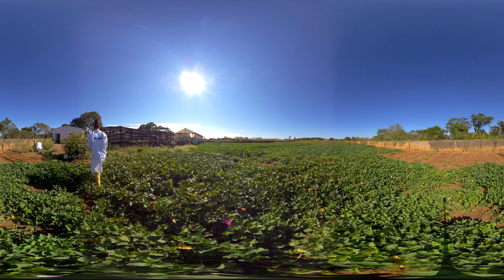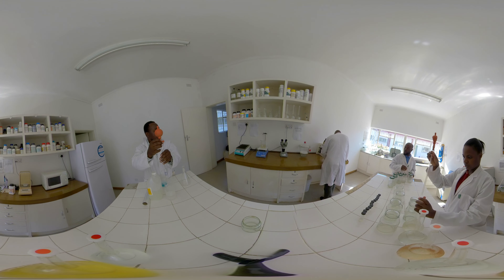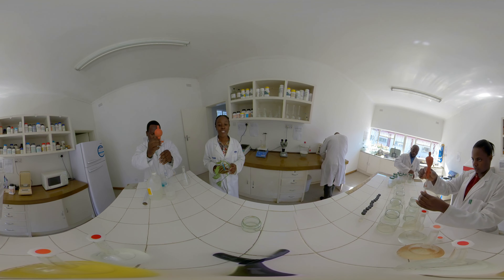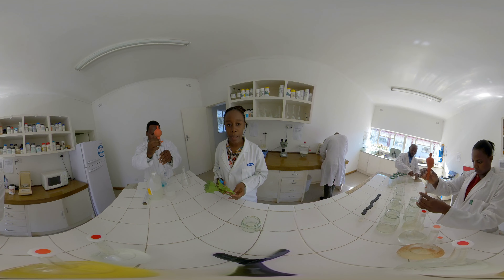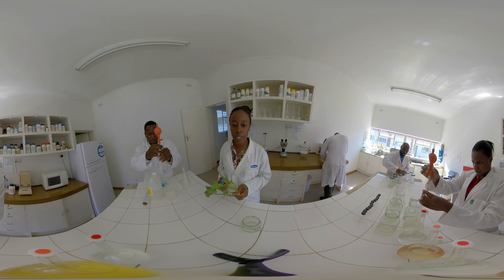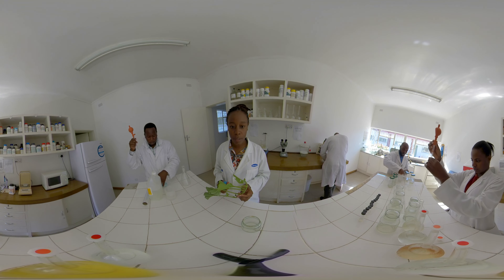Bio-technologies are strategic for national development and are meant to enhance the food production sector delivery, among other economic sectors. This is our main tissue culture lab where we conduct our plant preparation, media preparation, and sterilization procedures.